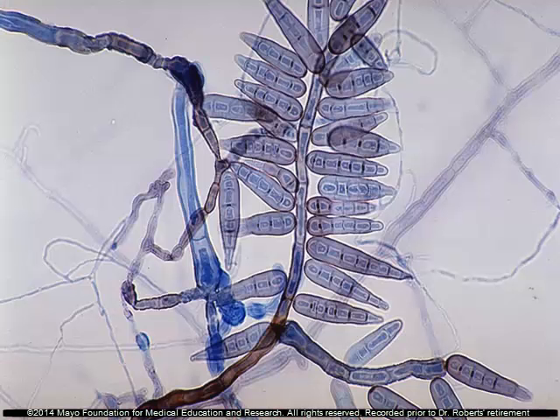Now, this is an example of what you would like to be able to see. This is an organism that has all the spores attached to the conidiophore the way they were grown up. This is what the Scotch tape prep allows you to be able to do. If you get it from the right place in the culture, you will see the spores that are attached just as they were growing in the culture. They're attached to the Scotch tape, and then you can see exactly how they're produced and exactly how they look. And in this way, you can be able to get an idea of what it is that you're dealing with.